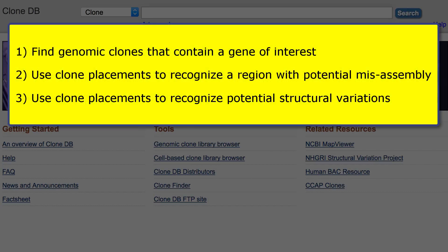Here are the three examples we'll cover: find genomic clones that contain a gene of interest; use clone placements to recognize a genomic region with potential misassembly; and use clone placements to recognize potential structural variations.